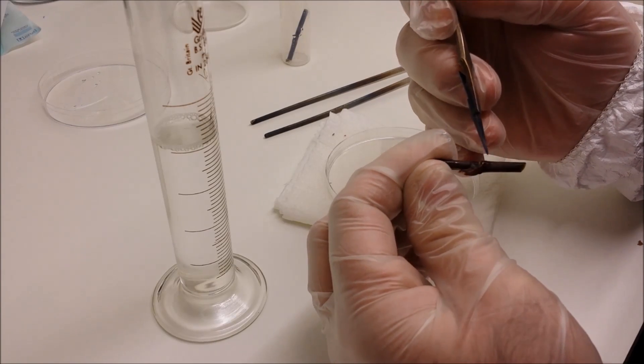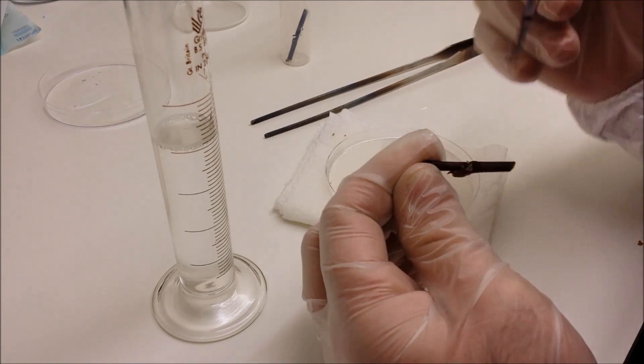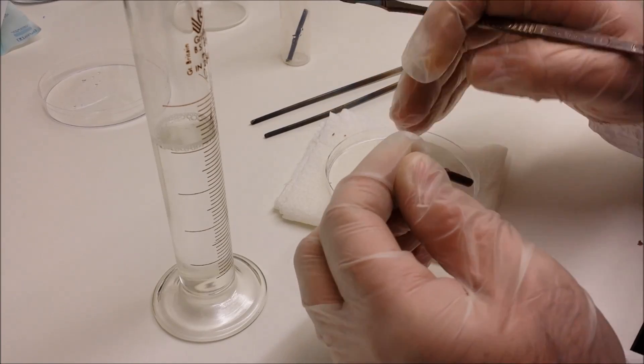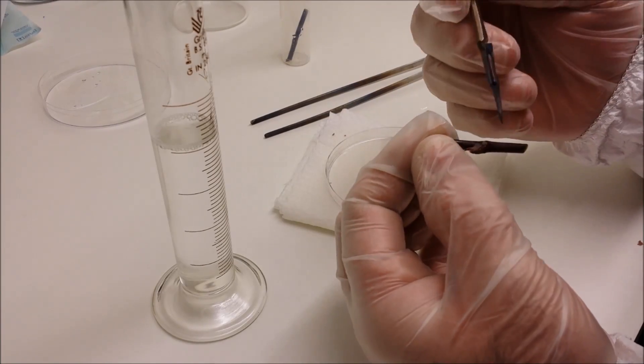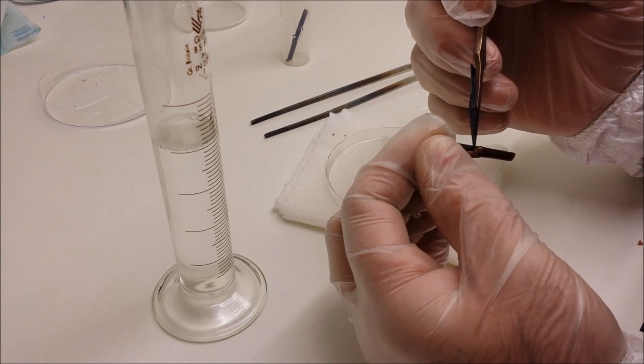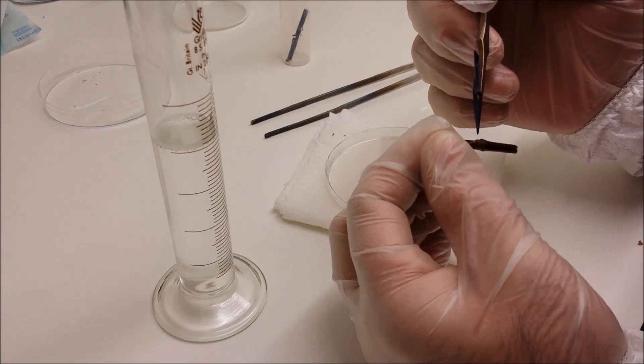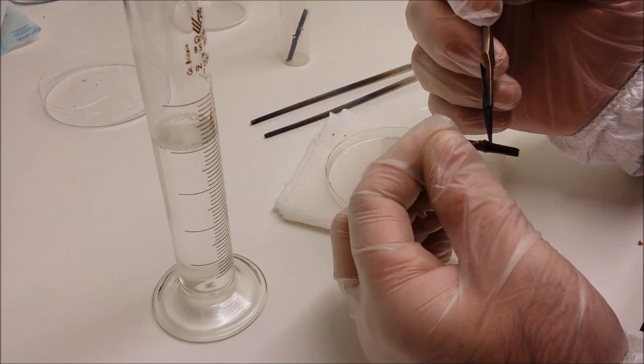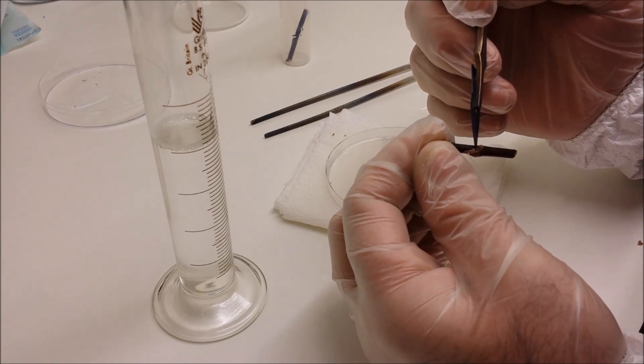And the work surface that you can see in the background, the white, has also been completely sterilized by wiping it with IPA, which is isopropyl alcohol, and as the glass, all the vessels and all the utensils, everything's been wiped down and sterilized.